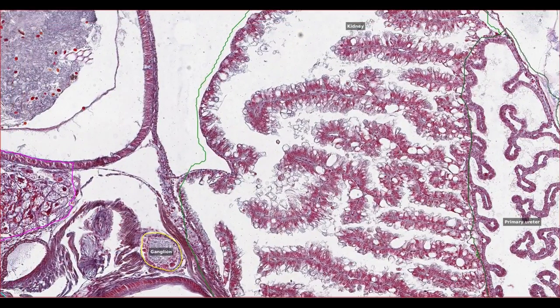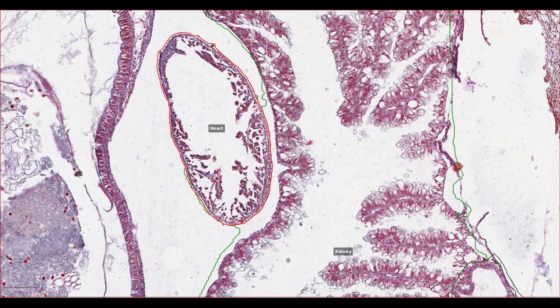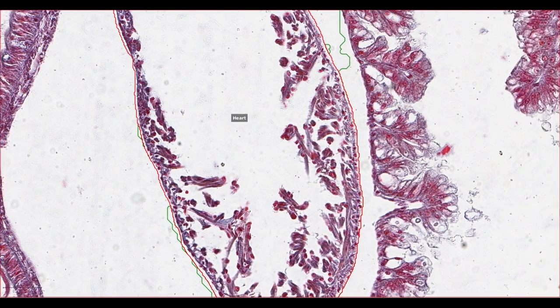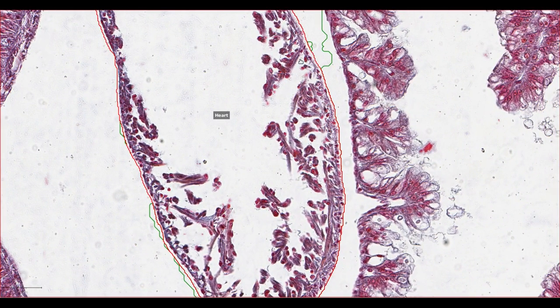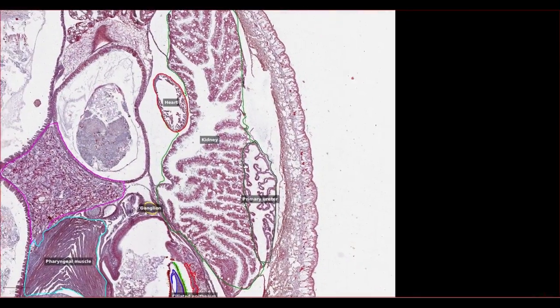Between the kidney and the intestinal tract, just up here, there is a hollow oval structure with a thin, muscular-looking wall. This is the snail's heart, which will pump its blood around the snail's circulatory system.